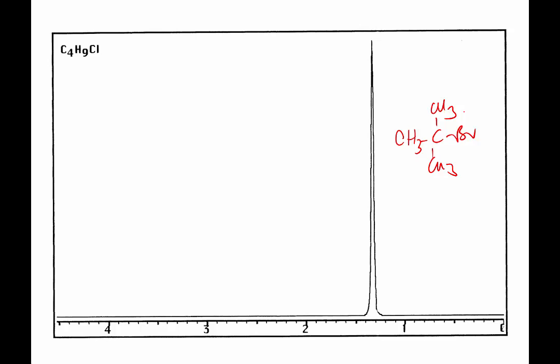So you take one of those, you can practice. This just was matching up the spectrum to the compound. But I want more than that. I want the actual individual peaks matched. Right? So you take those. I will put the answer key for the practice problems online tomorrow. And then the other ones you'll bring back next week, and we'll finish up spectroscopy. This is 340.